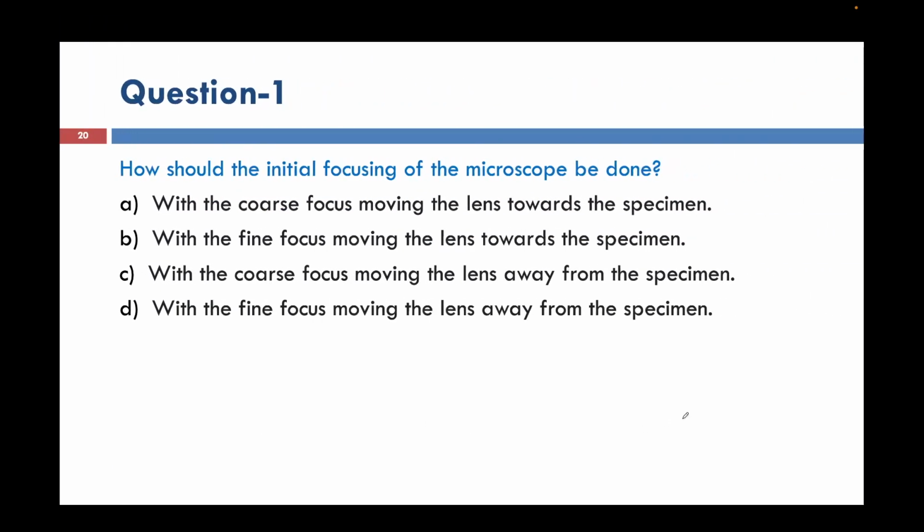Okay, if no one is having doubt, then we'll see question number 1. The question is, how should the initial focusing of the microscope be done?